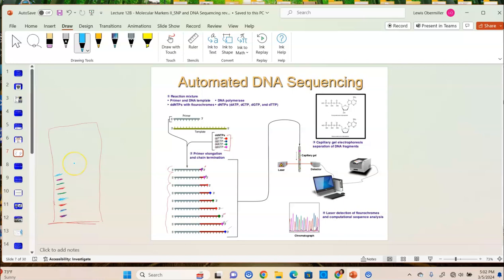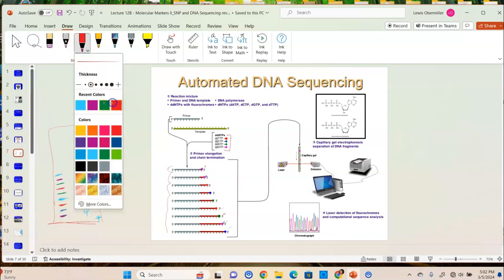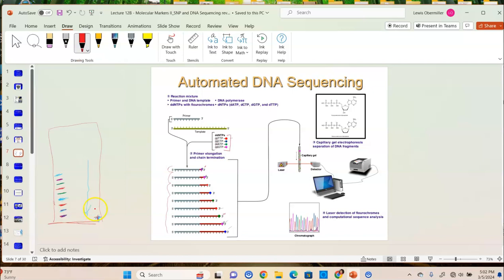So this is how the fragments would look in a gel. And as they go through, they're going to go to the positive end. This is the worst color for me to see on this screen. So they're going to run to the positive end. DNA is negatively charged, right? So it's going to run to the positive end. And as they go, the laser is going to read this and it's going to give us a peak, right?